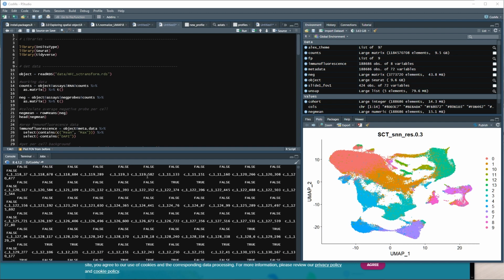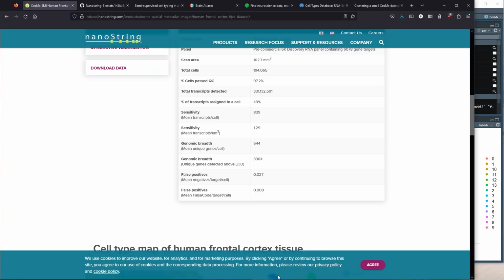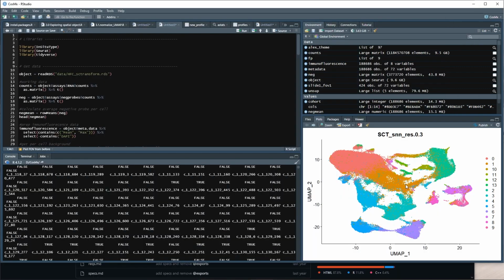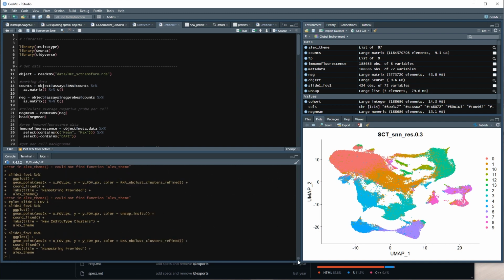Today we're going to do some annotation for the InSituType Spatial Transcriptomics project that we're working on. I've run everything because I realized after last time that these videos can be incredibly long. So I have run everything, and we'll just go over the results as they come out.